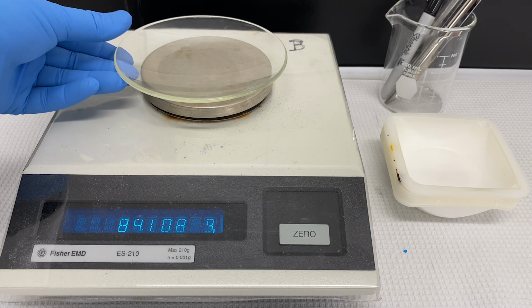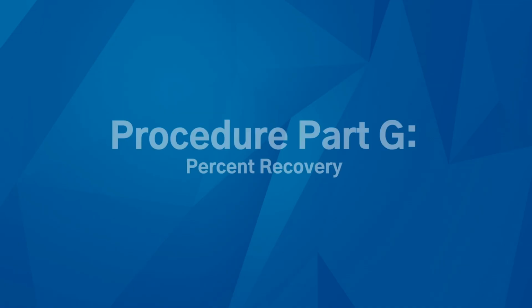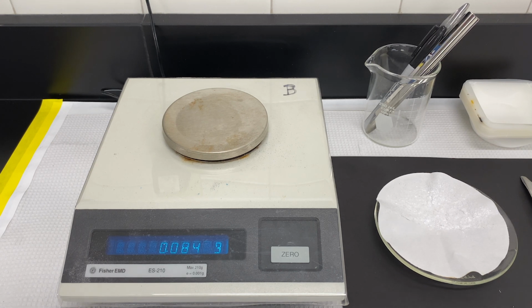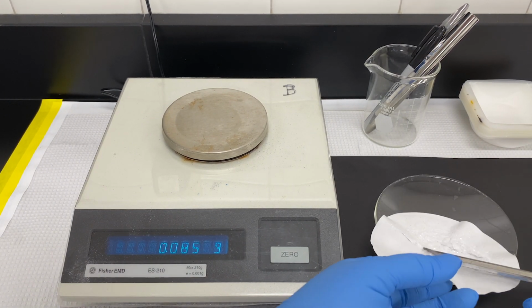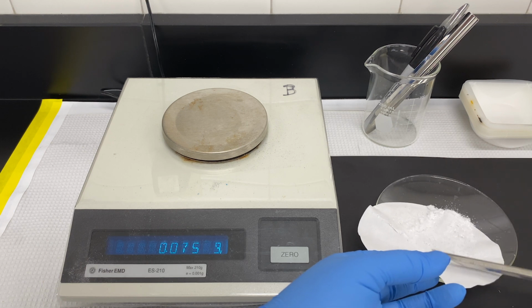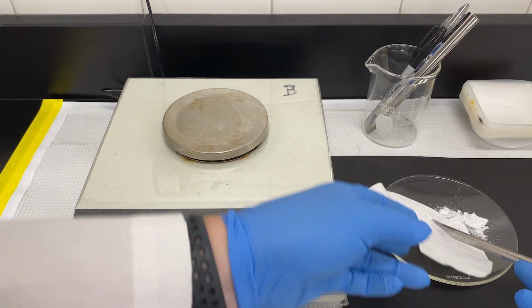We're going to weigh it by difference. We're going to get the weight of the watch glass, then we're going to scrape the material that we're interested in onto the watch glass and reweigh it. Then we're going to take the weight of the watch glass from the weight of the watch glass plus the material.